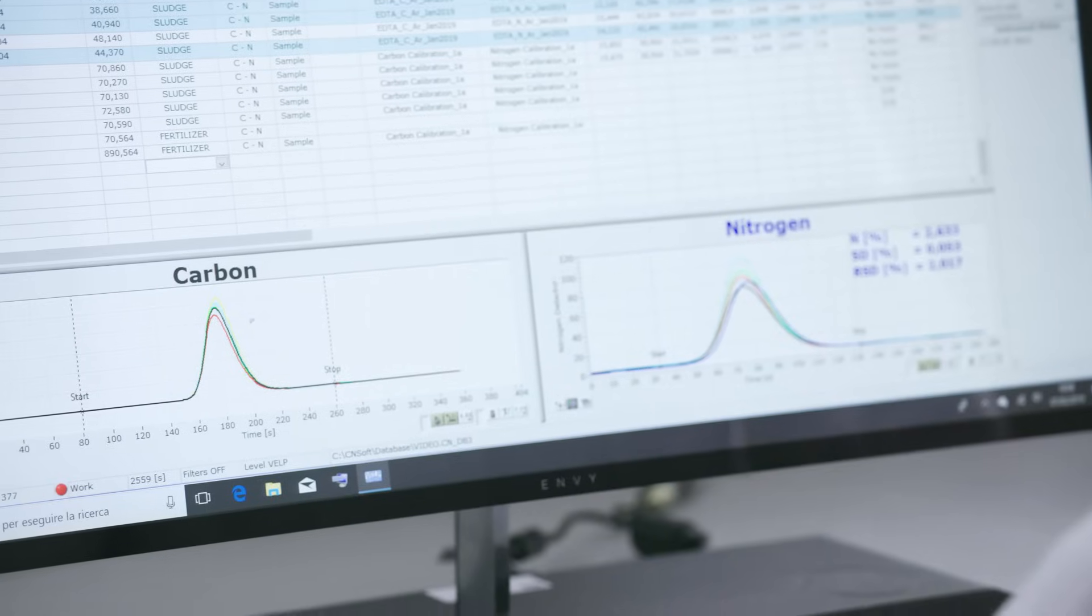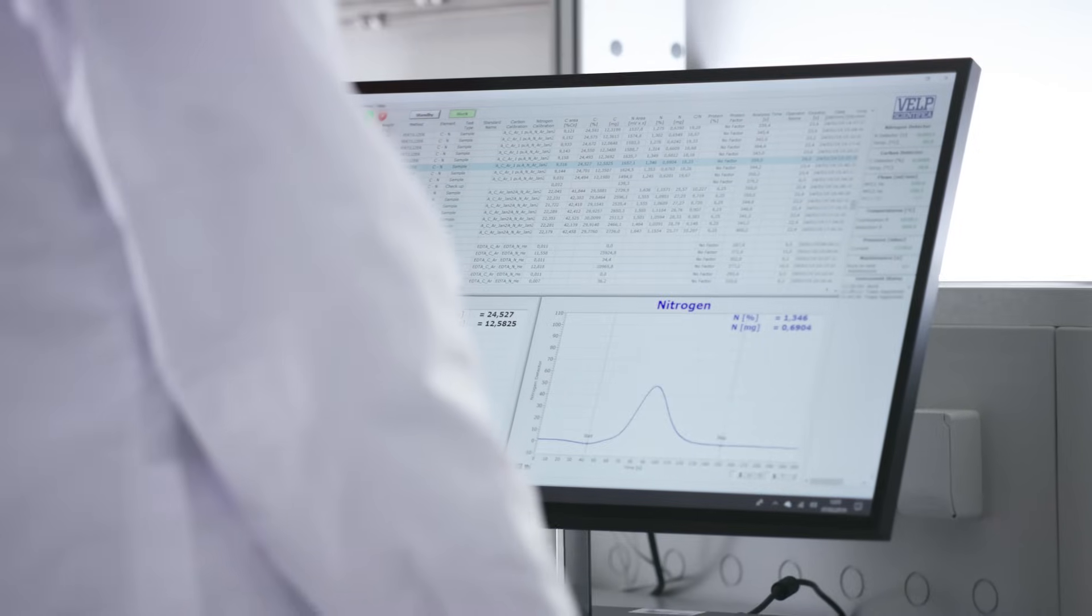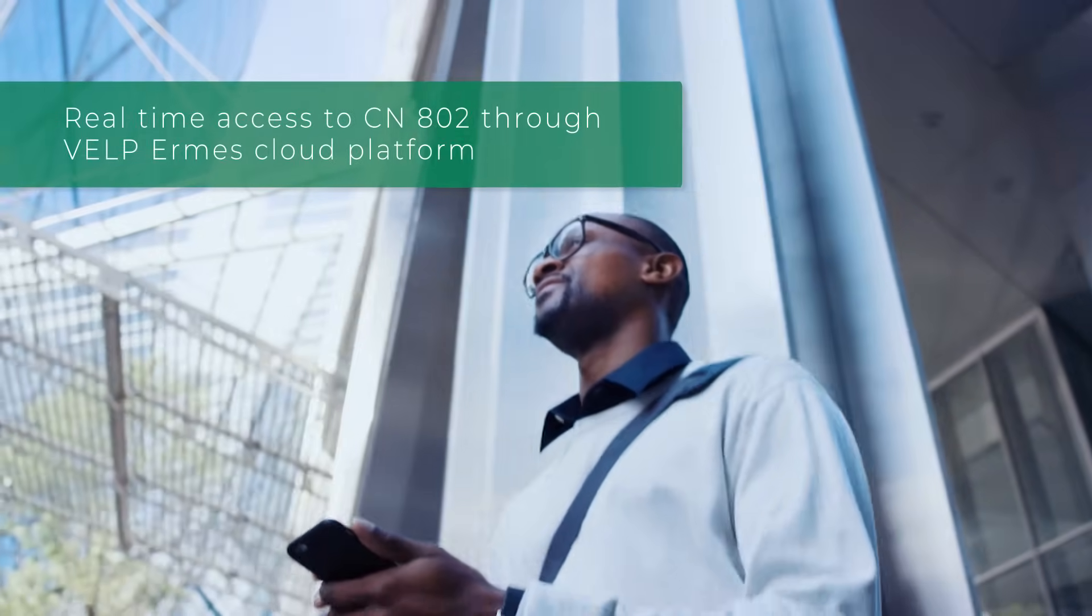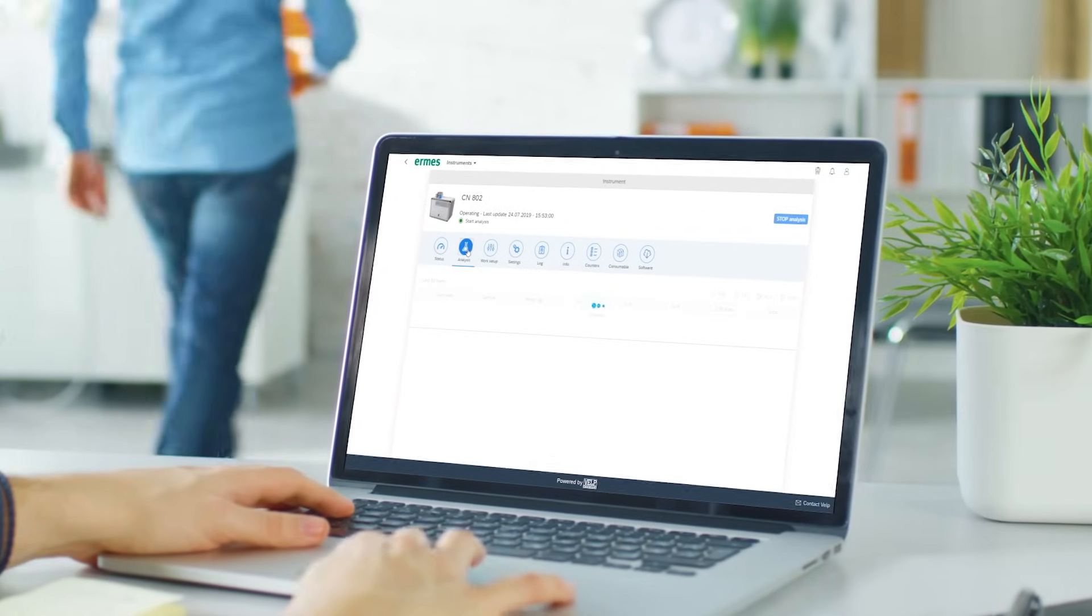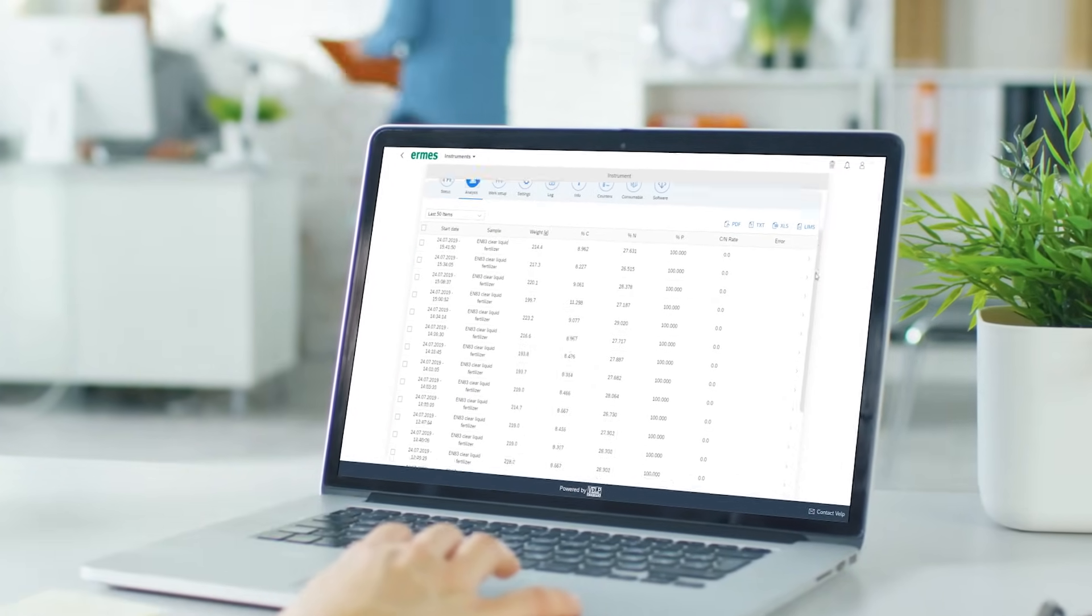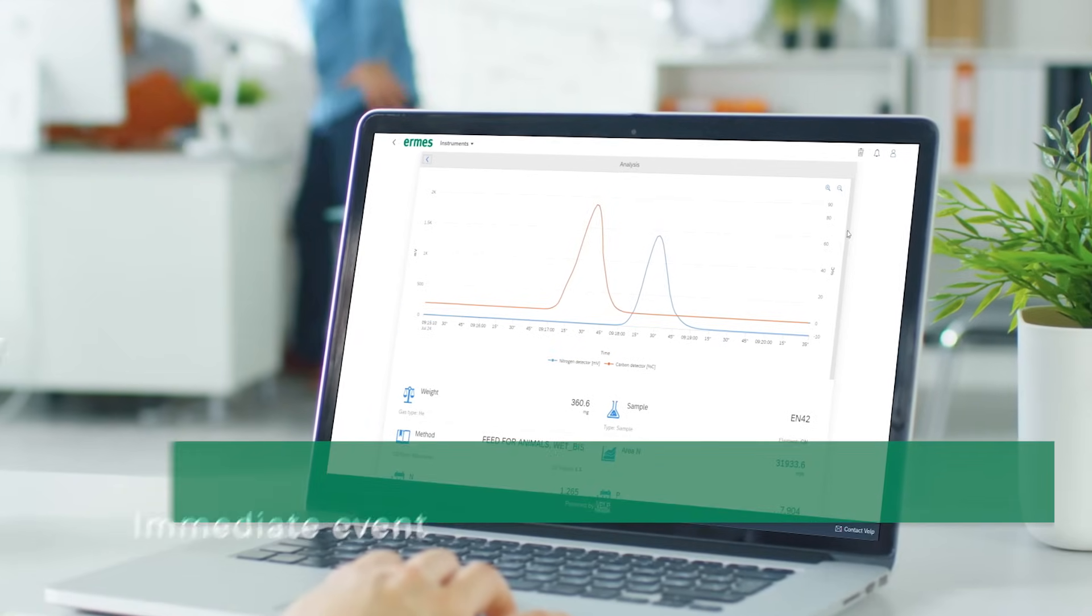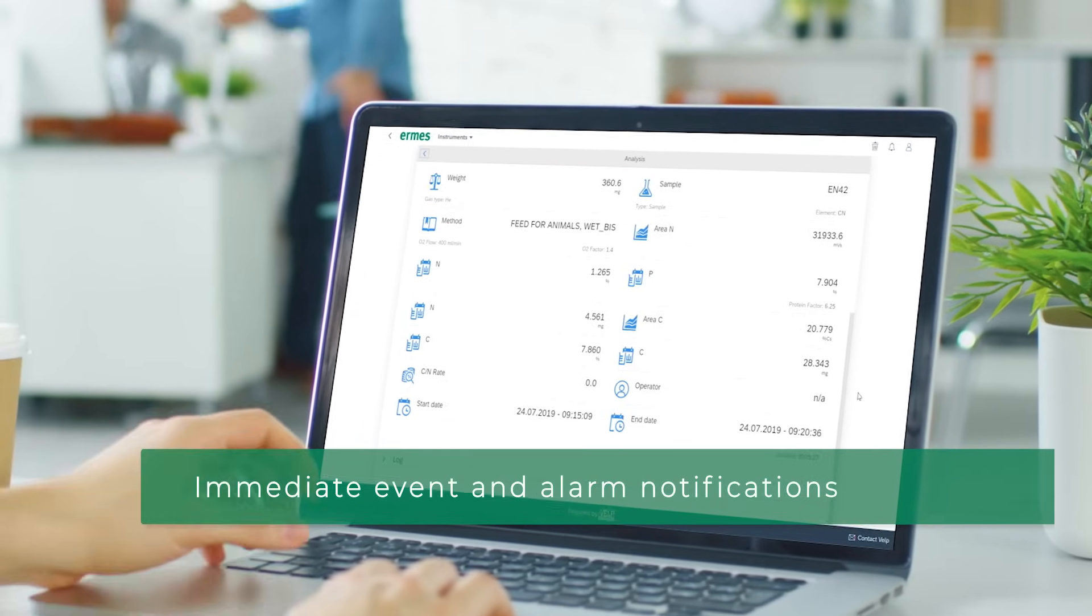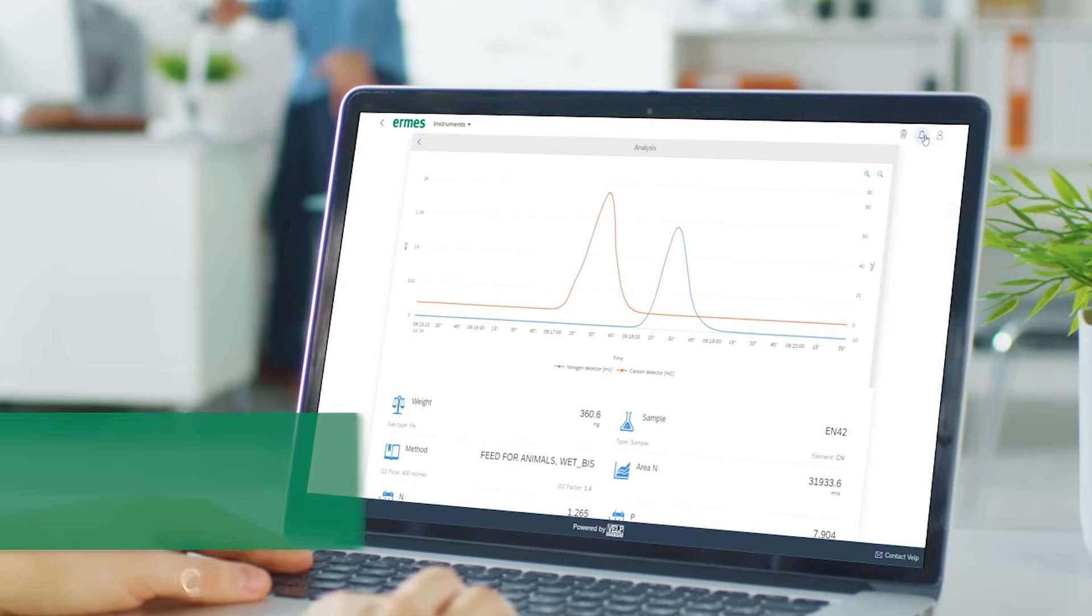Two graphs in the dedicated software will show nitrogen and carbon results. The VELP CN802 is designed to work unattended and by connecting to the VELP Hermes cloud platform it is possible to monitor and control your analysis remotely in real time and to receive immediate notifications. VELP Hermes will allow you to have an instrument that improves over time.